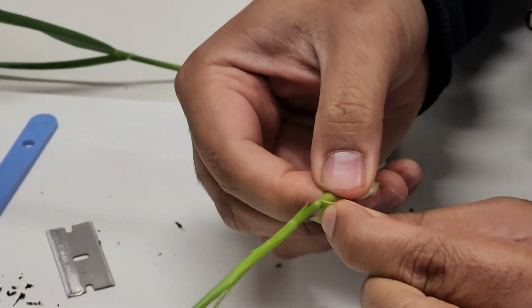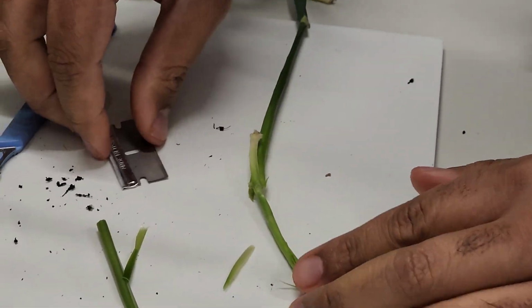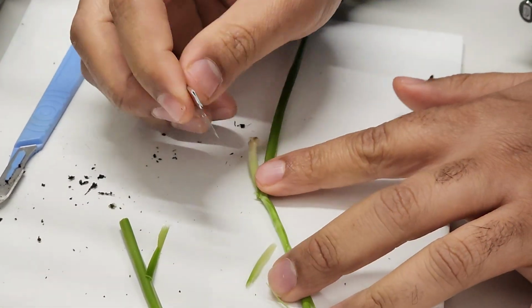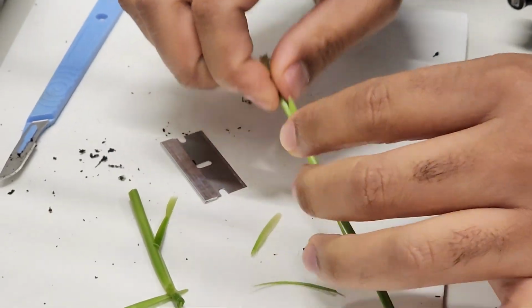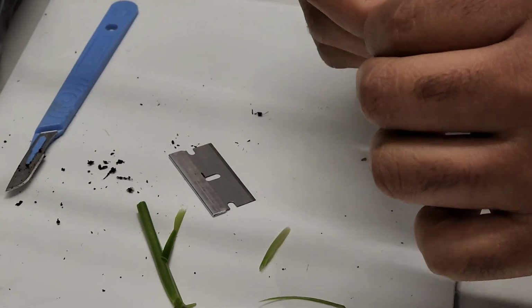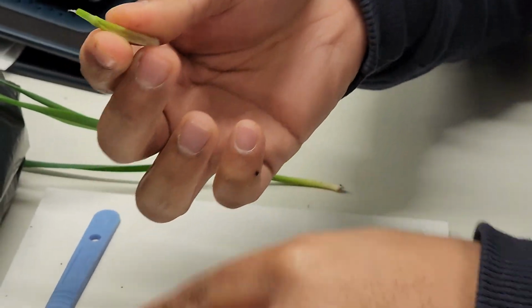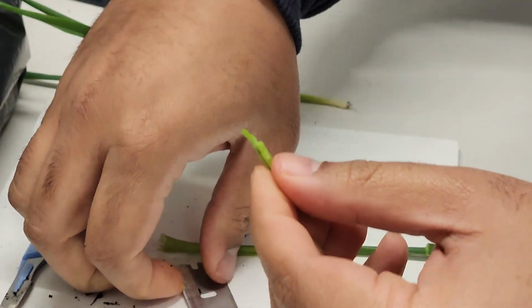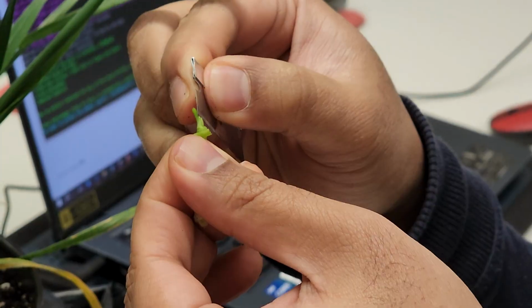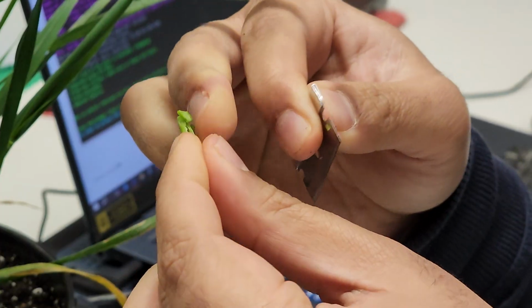Okay. If I'm right, there should be meristem in there. This is hidden. Let's see. Anybody in there? Anybody in there? Where are they?